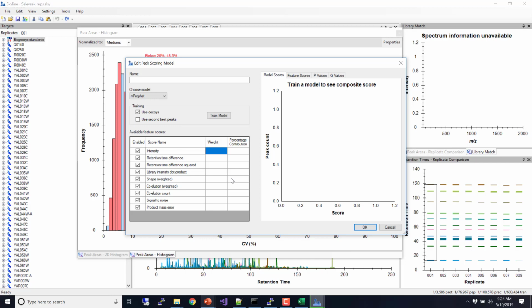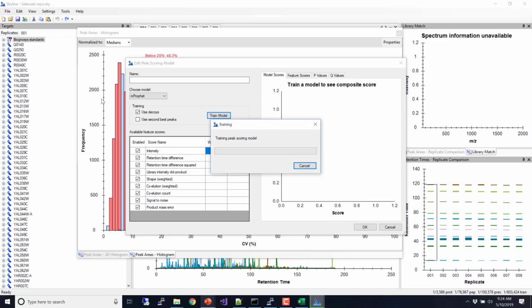But we're going to do it 2 ways. One way where we just take the library as it is and run everything and see if our statistics can clean it up for us, versus run a prior experiment, refine, and then use that for our important experiment. So let's train the model. As soon as you get up here, just click train the model, because that also takes time.